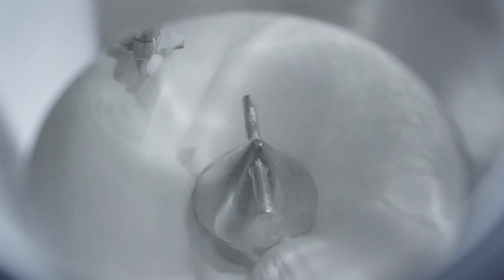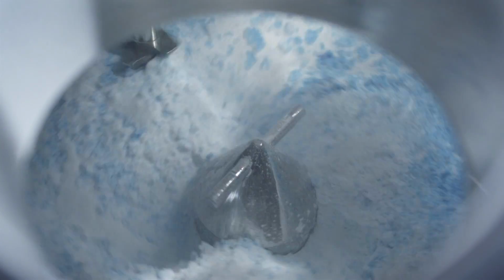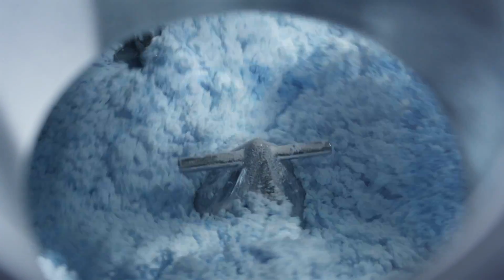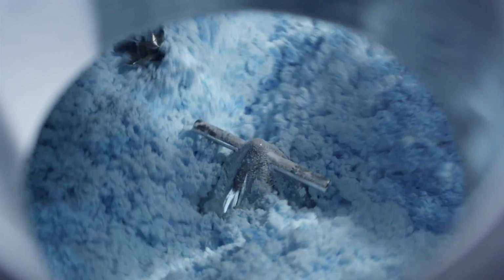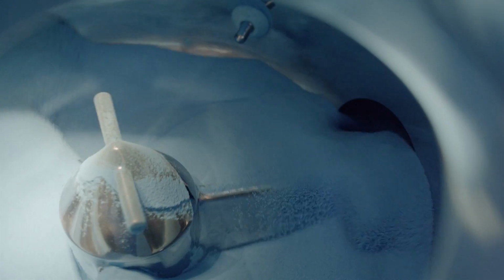Basically, the endpoint in granulation can be defined as the point at which granules achieve the desired properties as good uniformity, density, particle size distribution, and residual moisture. It is important to consider that each single step in high shear granulation requires an endpoint. Even if the wet mixing phase has the greatest impact in determining the endpoint, however, the starting dry mix as well as the liquid addition play an important role in granule formation.